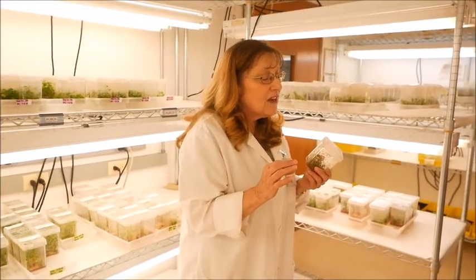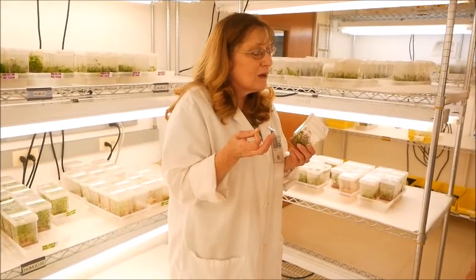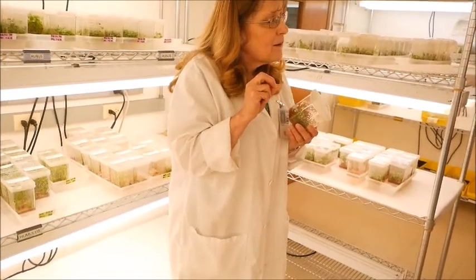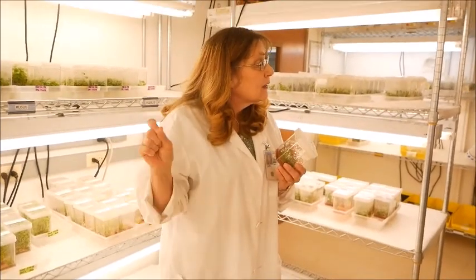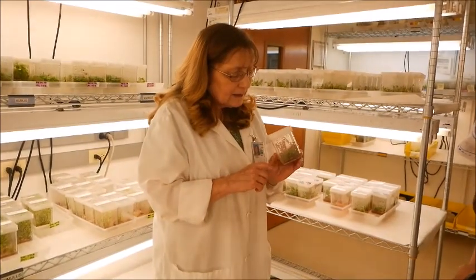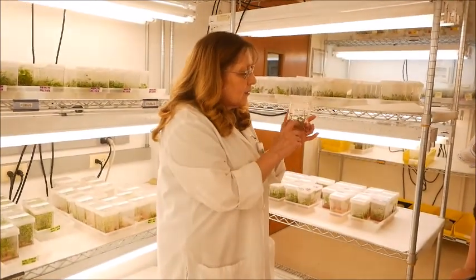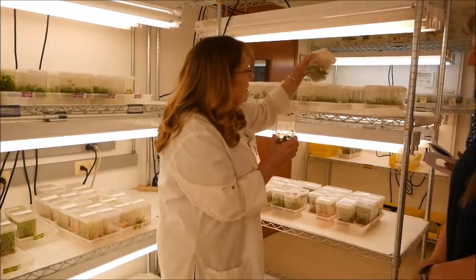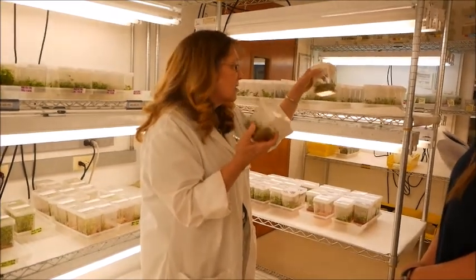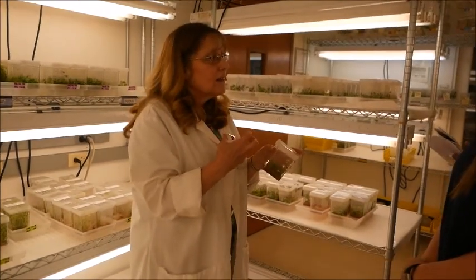If you have hazelnut, it doesn't keep — you have a little embryo down in there that could grow into a new tree, but it dies really fast. So they had under sterile conditions to excise that embryo, put it in a little vial, and put it in liquid nitrogen. Then we brought that out, thawed some of the plants in that seed lot, and grew them up. The red media — these are pears — the red coloring is just the iron formulation that we use, it turns the media red.